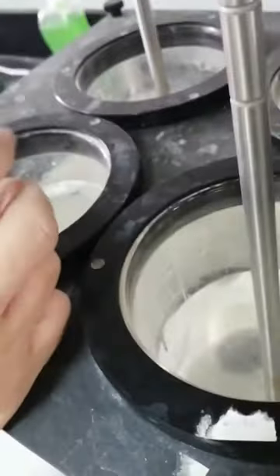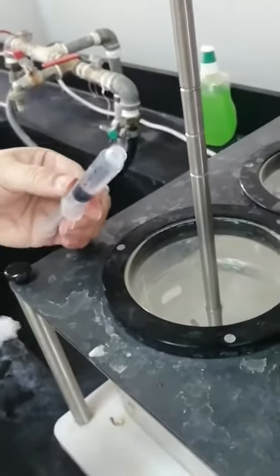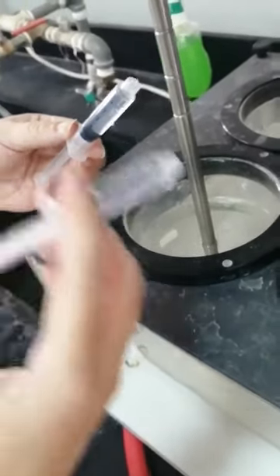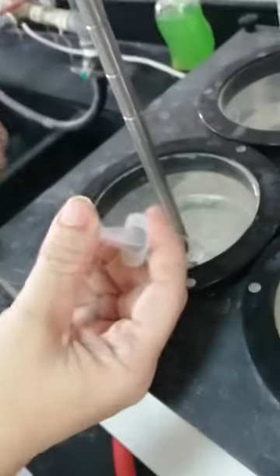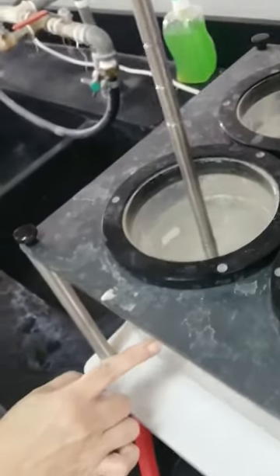So this is my sample. To keep the volume of the dissolution media stable for the next sample, I will add the same dissolution media, which is phosphate buffer, 5 ml, and I will resume the experiment.